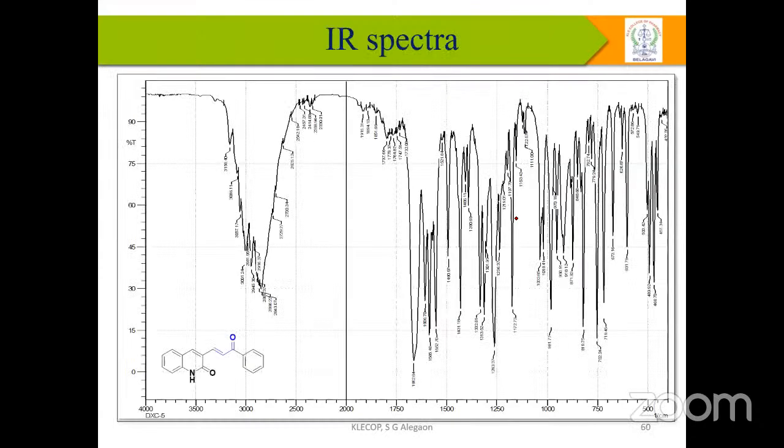But in normal IR spectroscopy, it is very difficult to assign. In IR spectroscopy I require an NH peak, and it is there, but there can also be moisture in a normal condition, and I also have the C=O character. There are lots of unassignable peaks in the fingerprint region. But as an organic chemist, we can go on whether I am going to get the required peak or not.